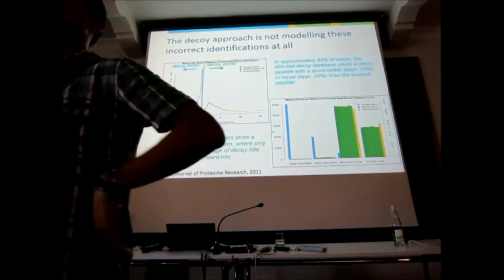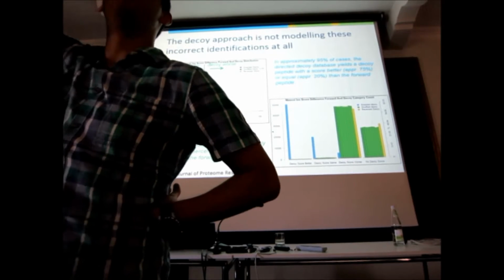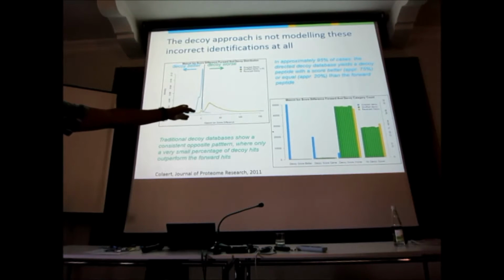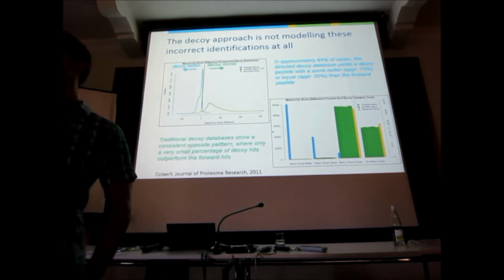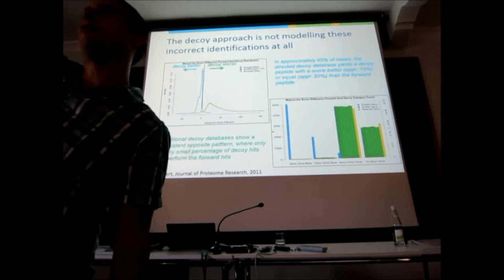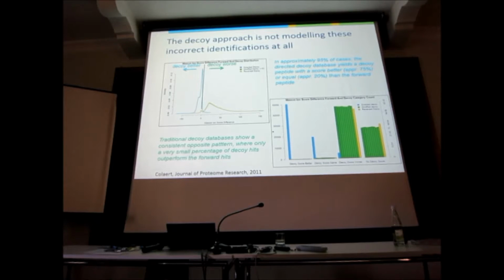So what is your chance of getting the right one? 1 out of 101, right? Because you're randomly going to pick a picture. The search engine gets at least 100 decoys, at least 100 imitators for each peptide. So by random chance, 99% of the decoys should be better. But it's only 95%. So to be honest, we pushed these guys to the edge and they kind of hung on by their fingertips for a few seconds. Which is not bad, it's not bad. But it's not enough. This is the same visualization of how the score is distributed, but it's not that important.